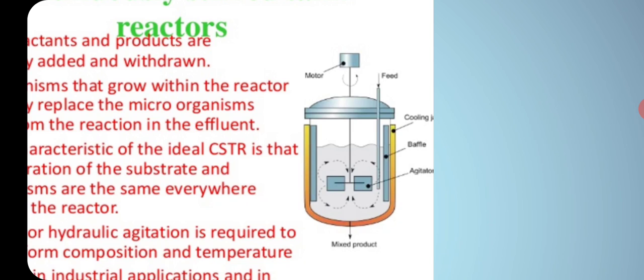As I first told you about the agitator system, agitation is very important. Here mechanical agitators are used. Now why are mechanical agitators used? Why are normal agitators not used? The reason behind this is to prevent contaminants from entering the reactor. A mechanical agitator rotates at a very high speed, and definitely a motor is there to adjust the speed of this agitator.